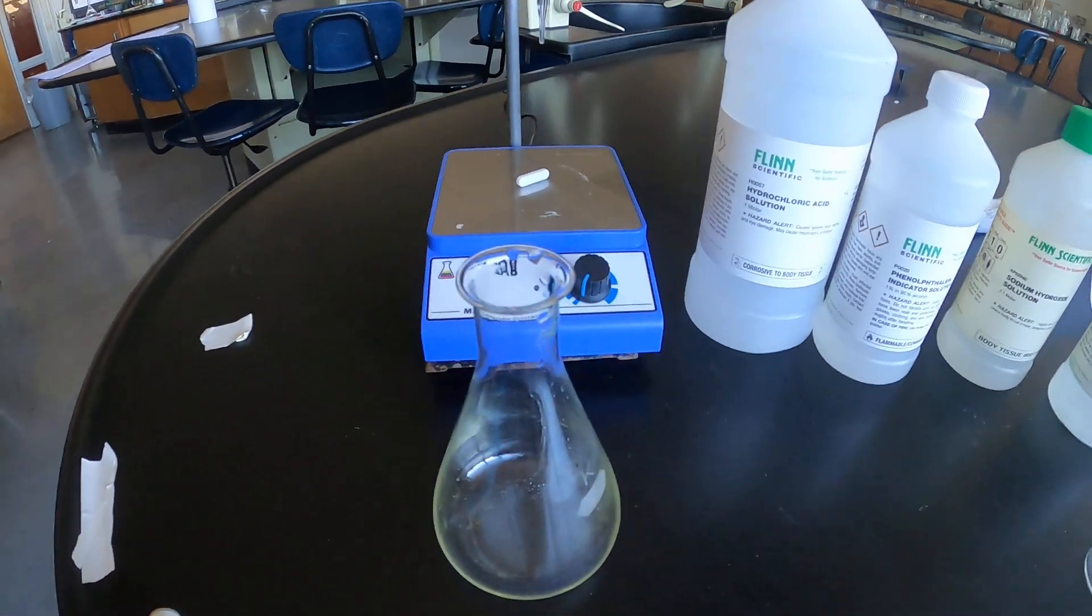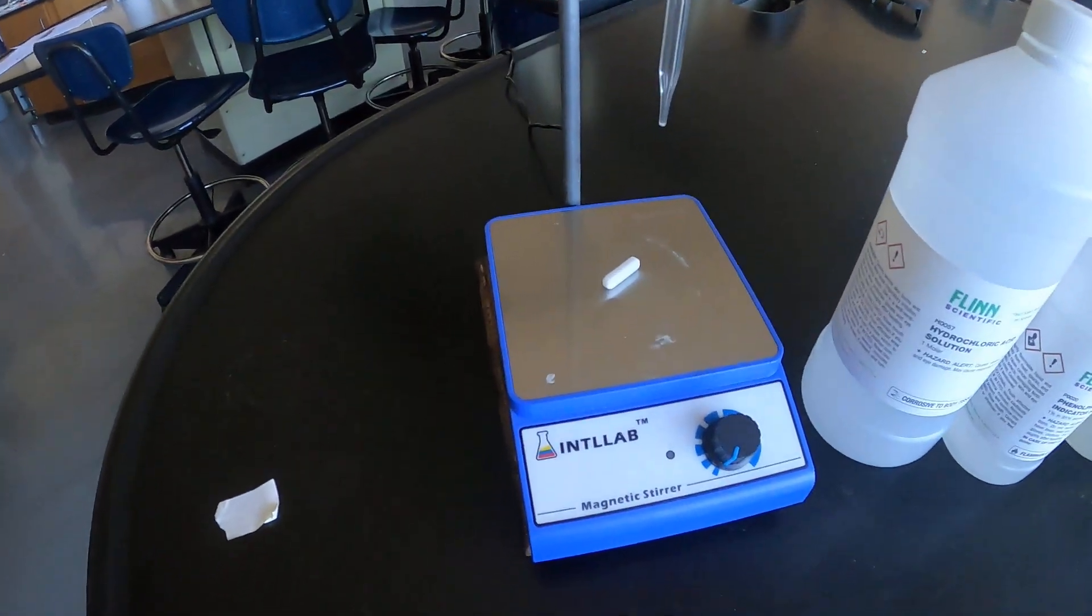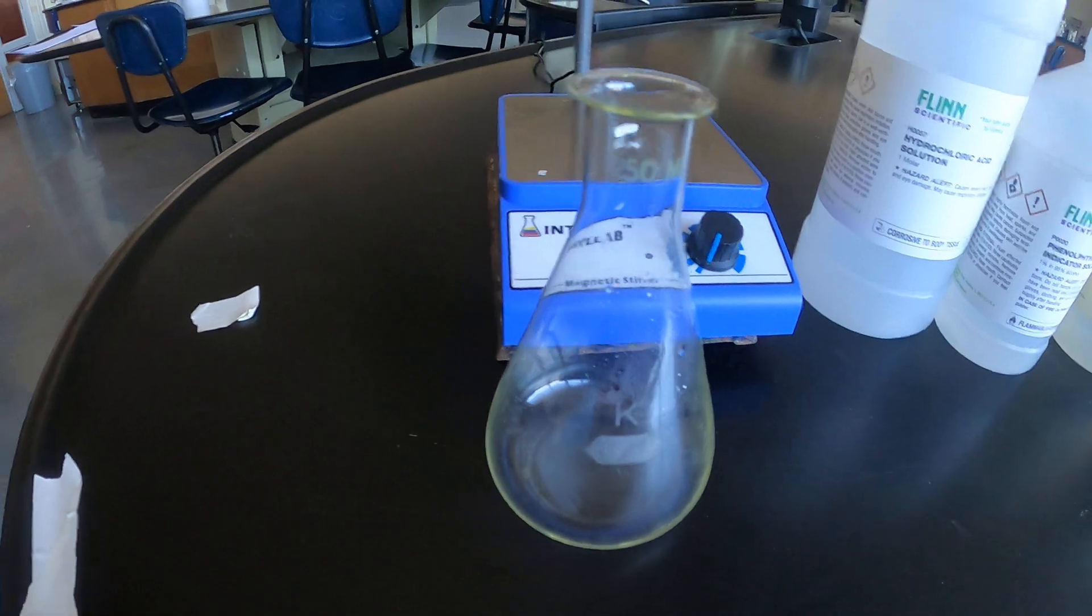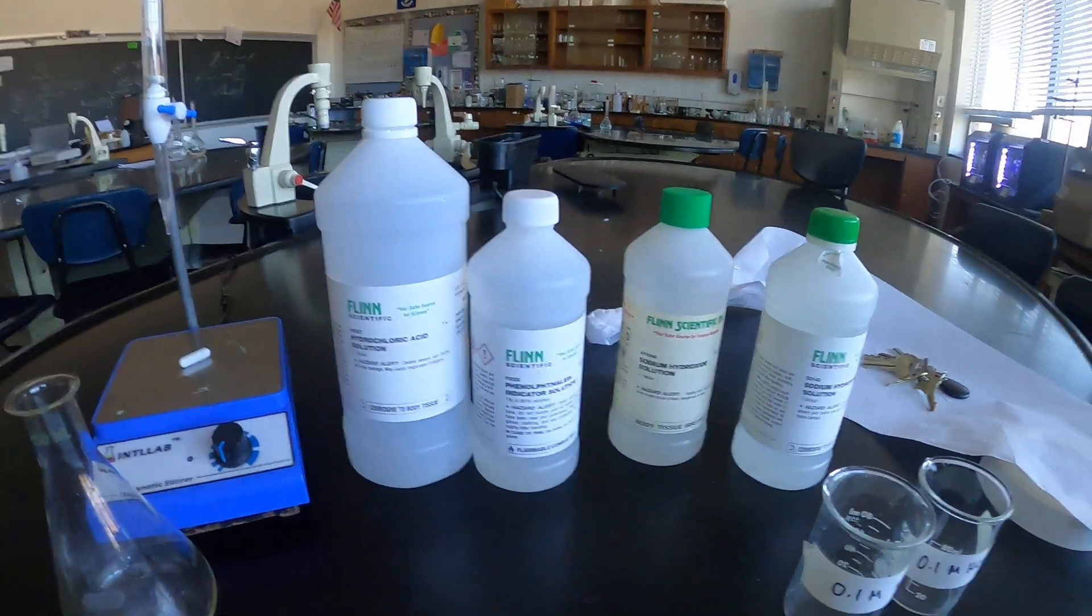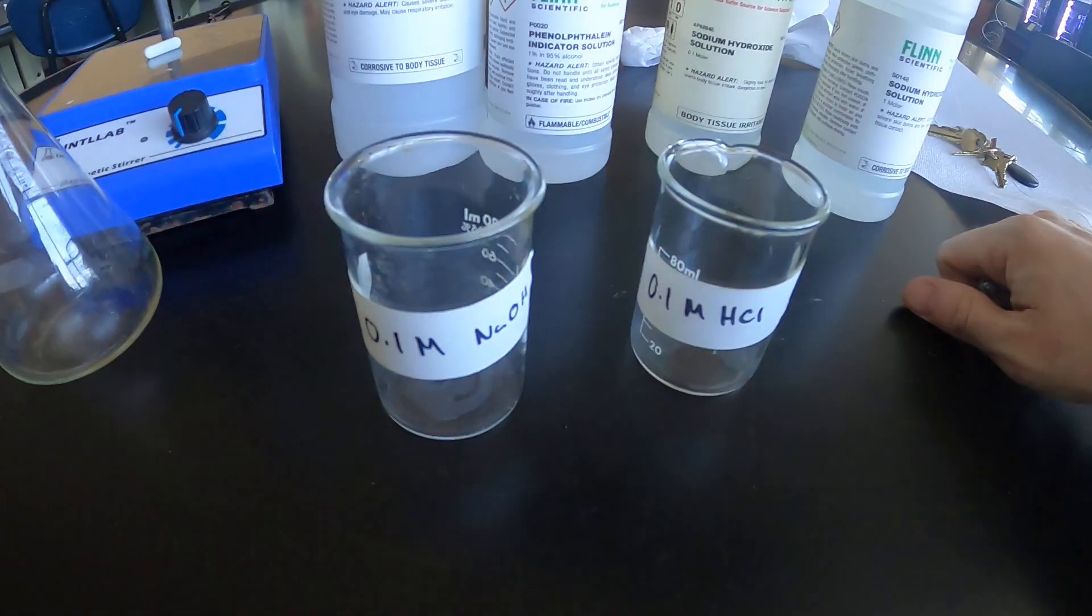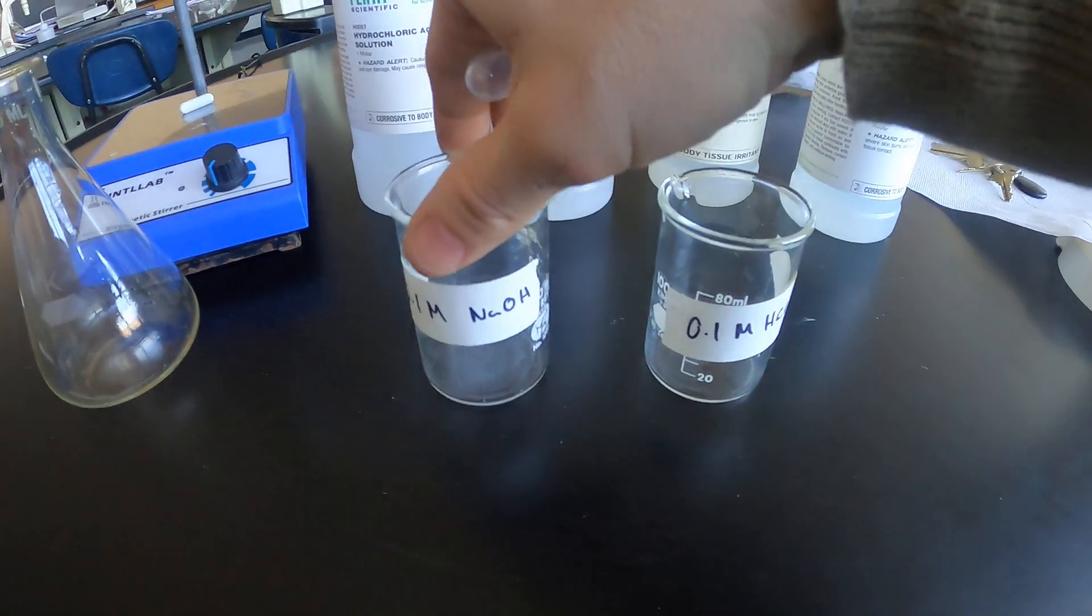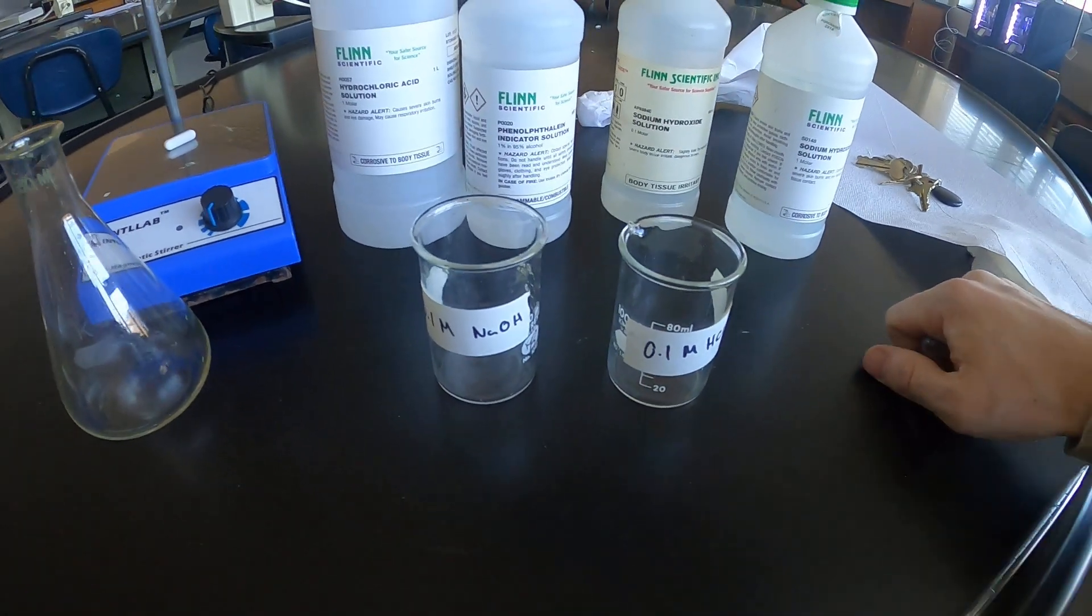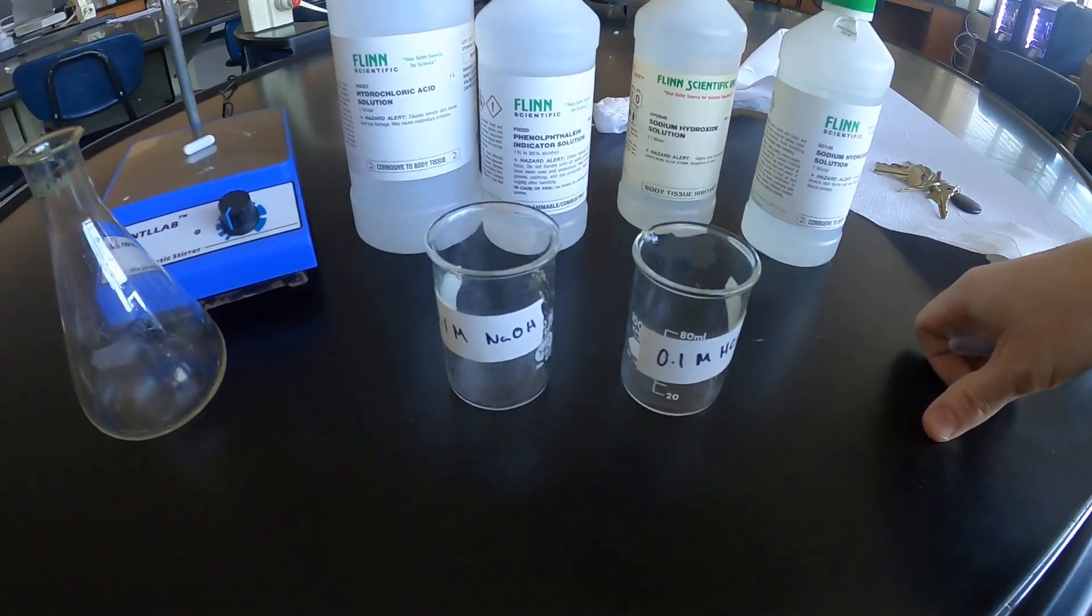Materials for this setup are burette and burette stand, stir plate, stir bar, and Erlenmeyer flask. We always titrate in Erlenmeyer because we will be stirring and we want to prevent splashing. Your acids and bases, essentially two labeled beakers with your acid and your base. Certainly one of them will be the titrant, one will be the analyte.